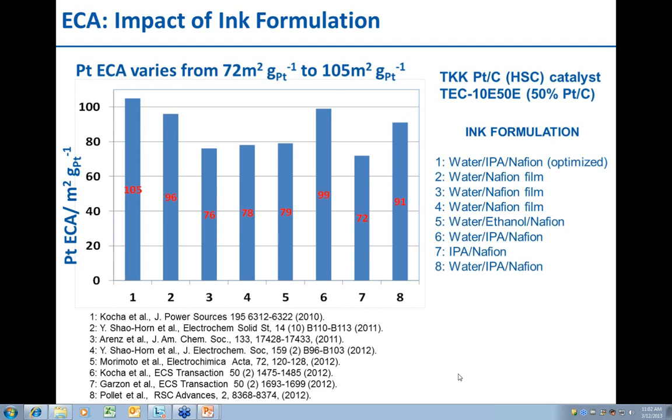We do look at the particle size distribution, TEM and so on for some of the inks, but that doesn't guide our use of a certain loading or thickness of the film. The two are kind of different.